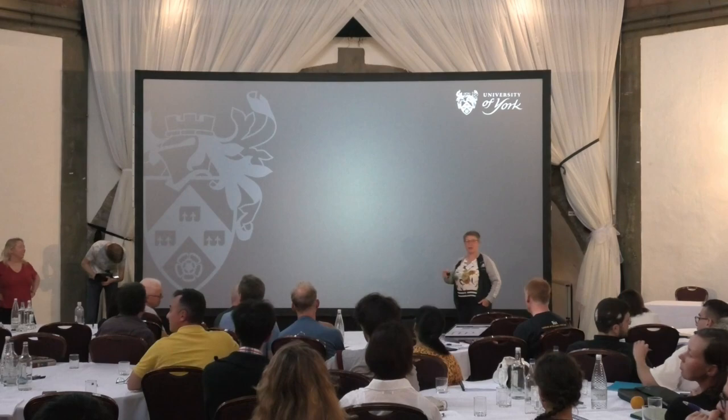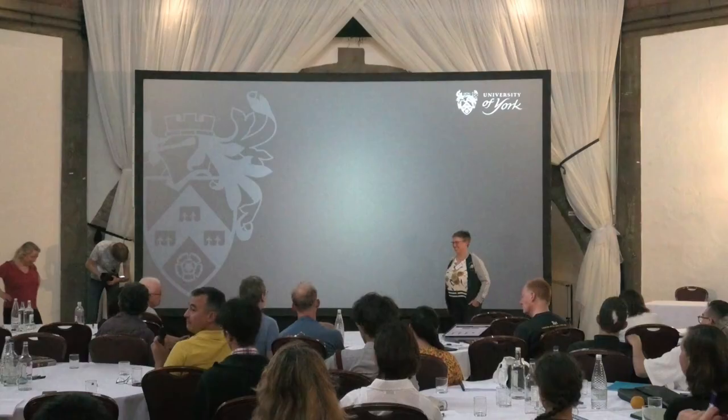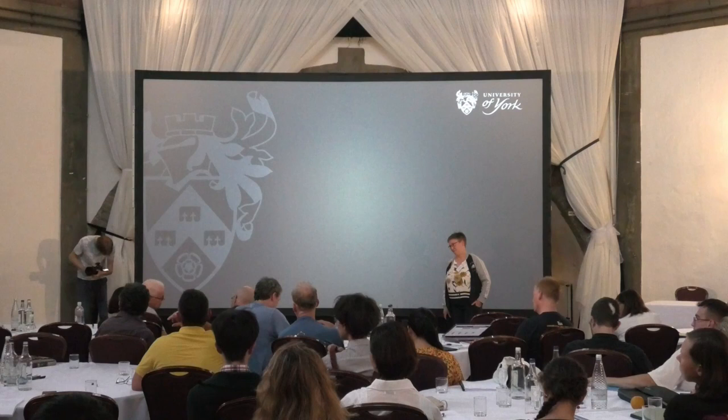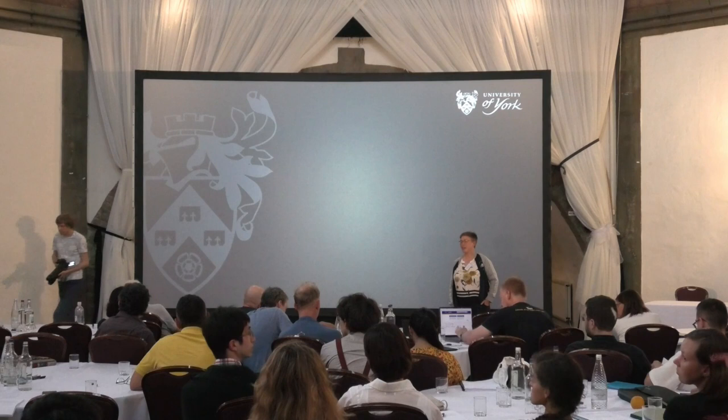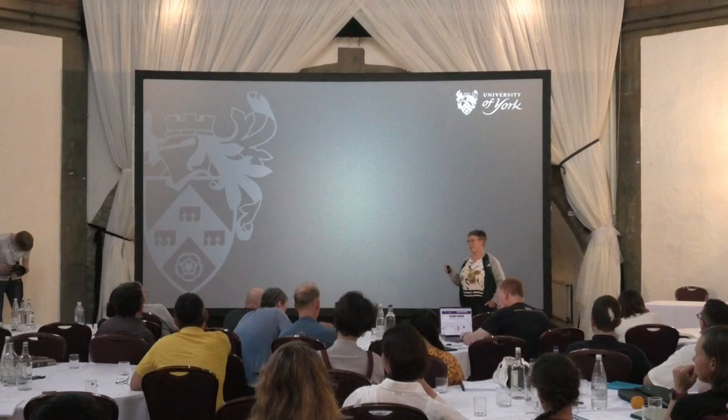Going back to the tomogram, I thought it was an ingenious idea to do template matching to figure out the state of the molecule. But what if you were to run template matching with the mature form and see if you can determine the... So we obviously tried it. But because the mature form is really smooth, it doesn't work.